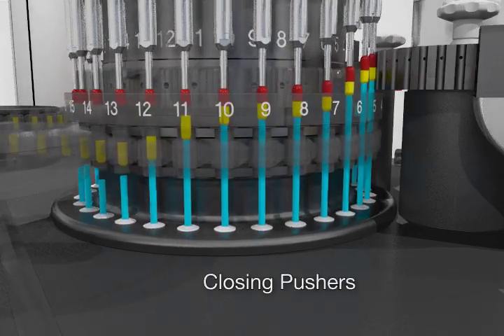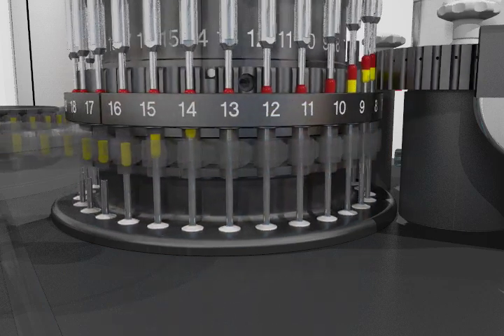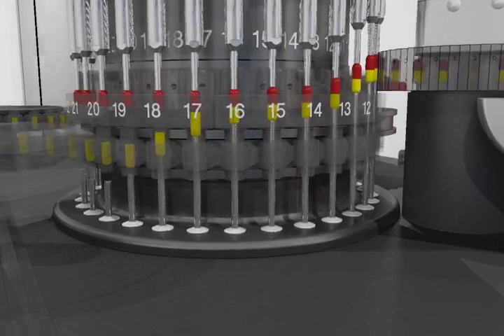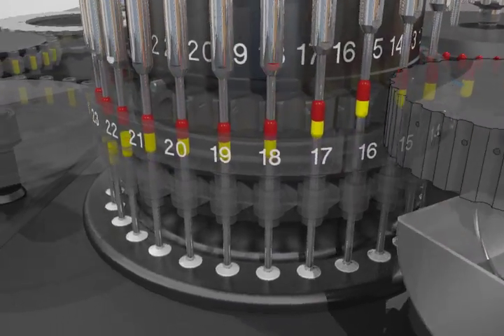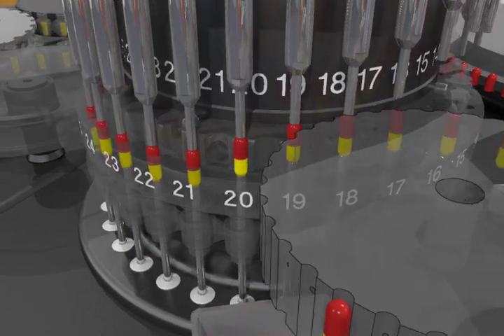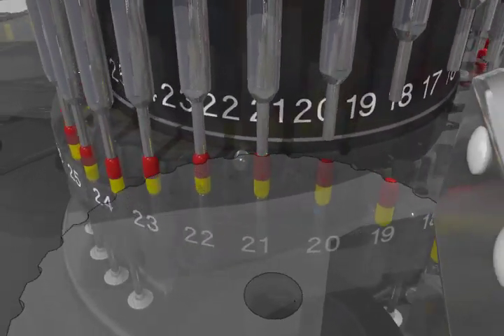As closing pushers rise, they push the bodies of the capsules into the corresponding lids being held in place by the contrast pushers so as to close the capsules. The contrast pushers continue to rise at the same time as the closing pushers to position the capsule for exit.